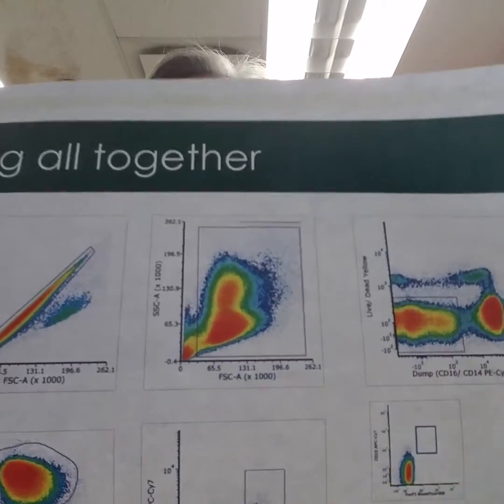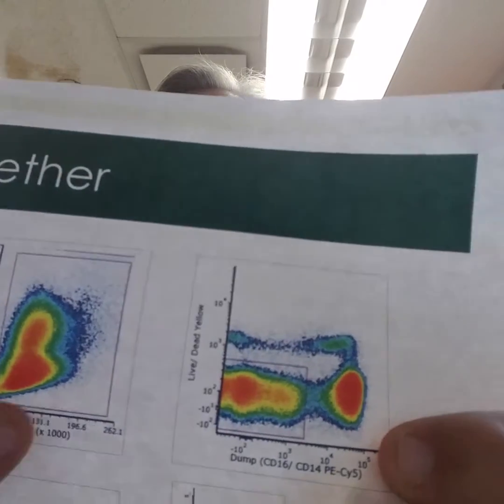From that, I move to the second gate, which is my pulse geometry gate. This uses pulse geometry area versus height to identify doublets versus singlets. We expect our single cells to lie on the diagonal. From there, I go to what I affectionately call the schmutz gate. This is the forward/side scatter gate that most people use to define lymphocytes. I use it to eliminate small punctate debris on the left side of the axis and things that are off scale.